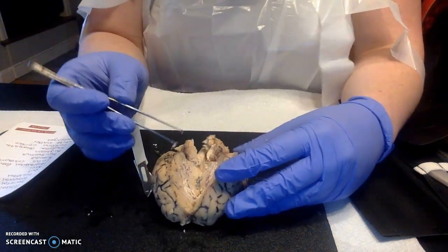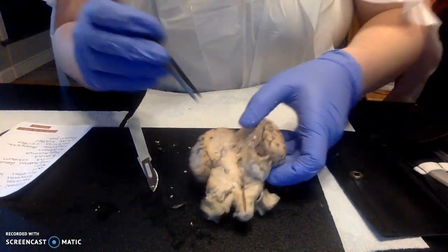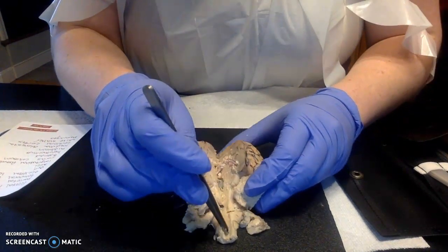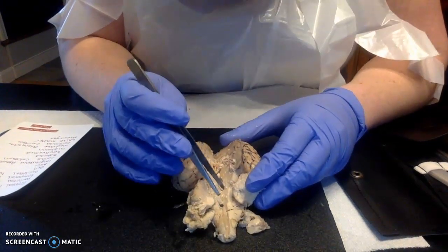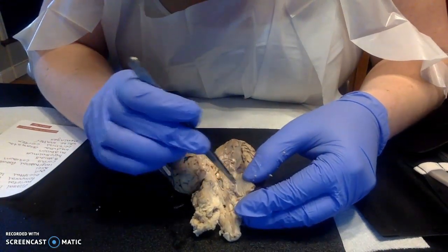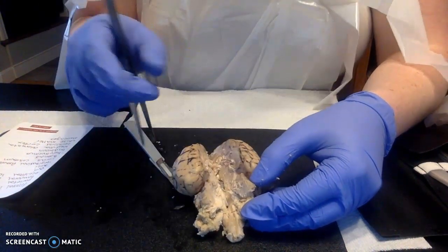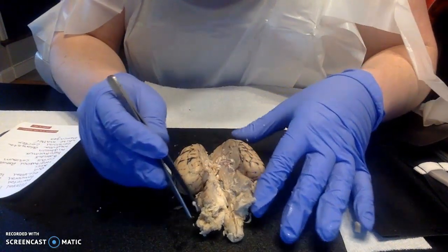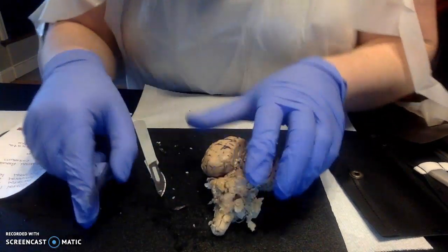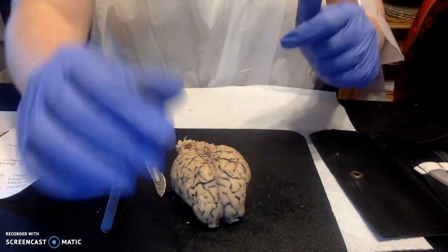And then we have the medulla oblongata, which is, if I flip it around, it's easier to see. You can see right here, this is the medulla oblongata. Within that, this got a little bit messed up as I was dissecting, but here's the white matter. And then down here is the meninges. And that is all for the sheep brain.